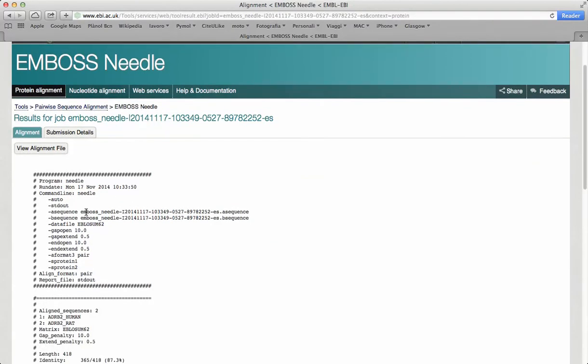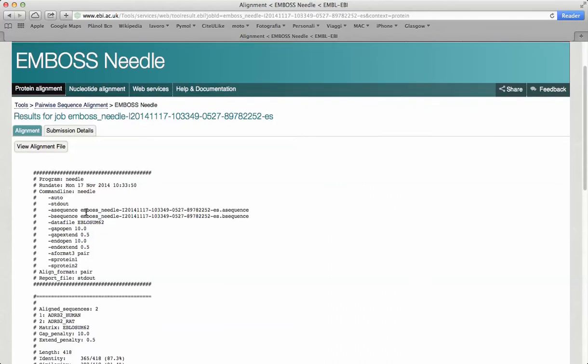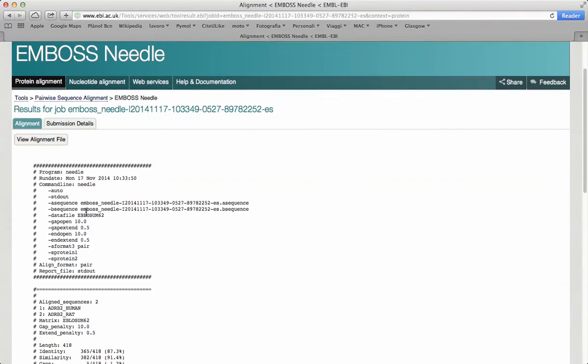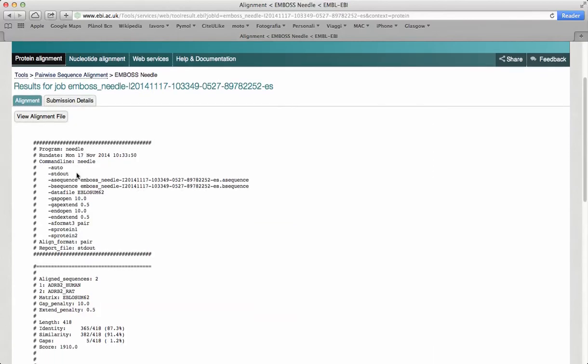The output of the alignment has three parts. The first part contains information about the program and the algorithm. You can see which program was used, when the job was done, and how to perform the job using command line on your computer.